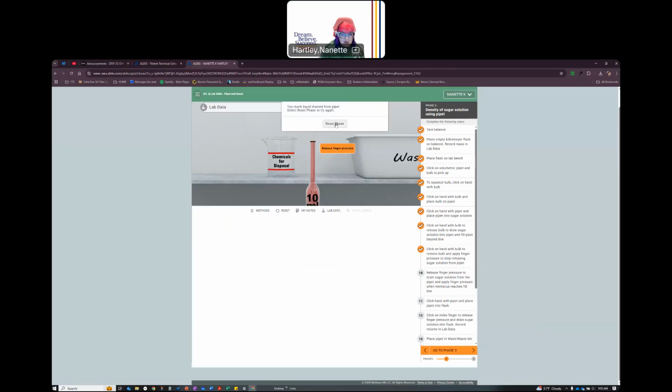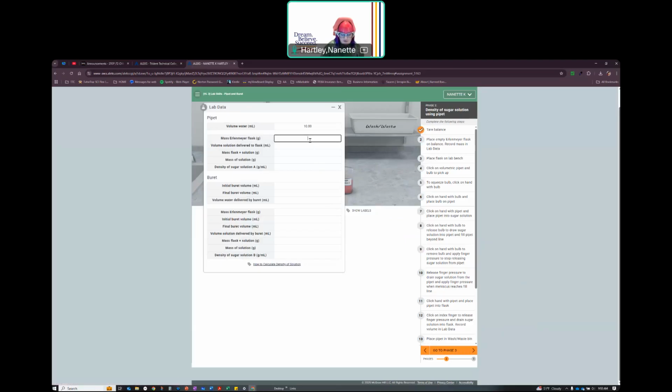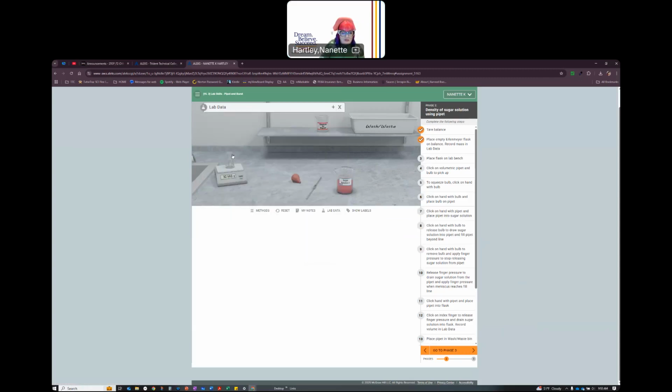Oh, too much, so I have to reset. Isn't that great? Tare it again. I'm going to put this back on here, 30.560. This off, pick this up, put this back on here.